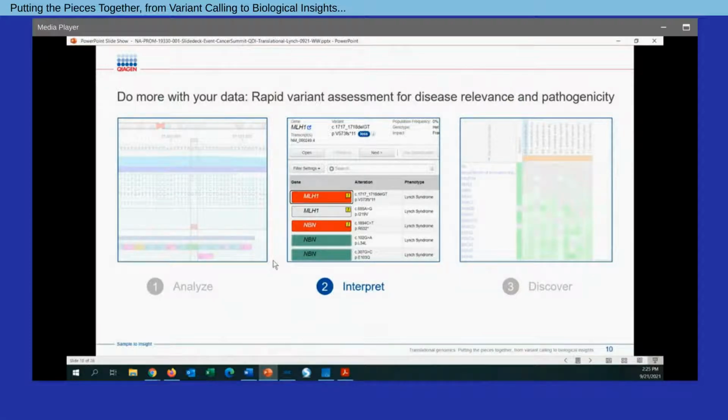For this process, typically our starting point is going to be a VCF file where we have a large set of variants. And our goal is to essentially utilize information to both filter and prioritize variants in our sample or our cohort of samples. To do this, we're going to rely on the QIAGEN Knowledge Base. Essentially what this represents is a massive effort of curation. As Beata alluded to, QIAGEN has a large curation team where we are continually going through the literature and capturing the relevant variant information found in studies. And in addition to that, we incorporate multiple third-party databases to help build our understanding.